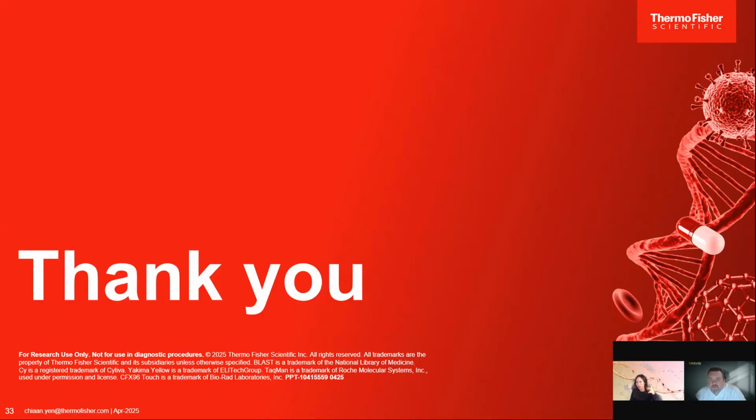And if you have a software that can align them, which I believe there's also free software like APE, you're able to align the sequences to make sure that your primer and probe, at least one, is sitting with enough mismatches with the pseudogene. And ideally, you want the mismatch closer to the 3' end, right? Because we know that's where primers sit down. So if the mismatch between your gene of interest and pseudogene is closer to the 3' end, or if it's an insertion or deletion, you might want to strategically put it there to make sure you're not picking up the pseudogene.